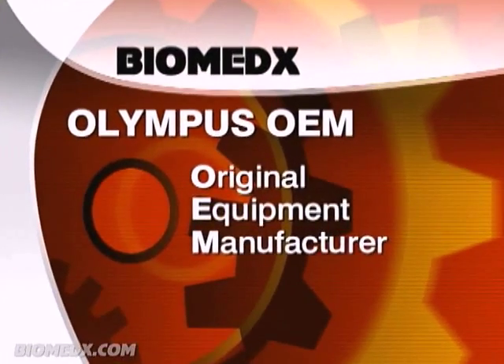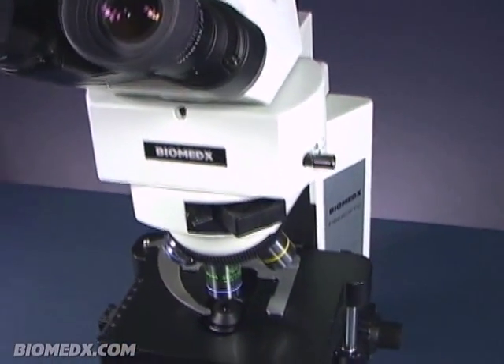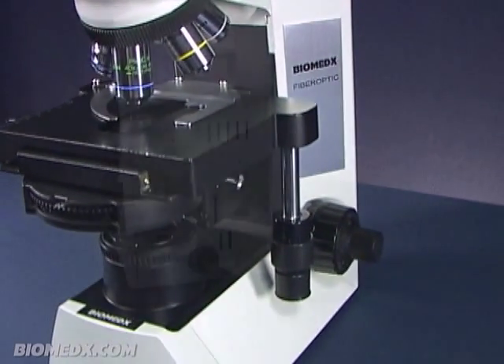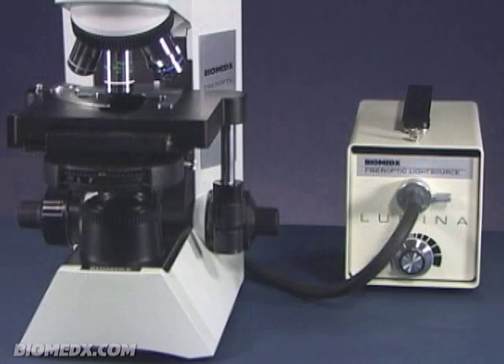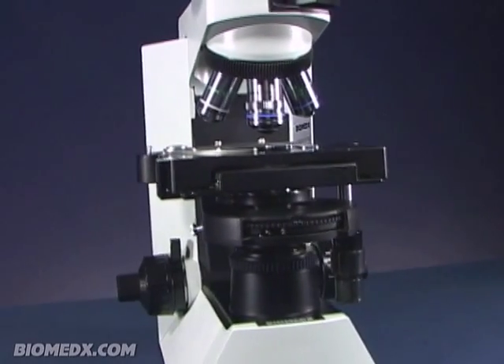Biomedics is an Olympus OEM and we take one of the small footprint baseline Olympus laboratory microscopes, which is lightweight and easily moved about, and we remove the low power light bulb and add a flexible glass fiber optic cable and external 150 watt quartz halogen light source. This means that a lightweight laboratory microscope that already possesses world-class Olympus optics becomes a heavyweight where performance is concerned.